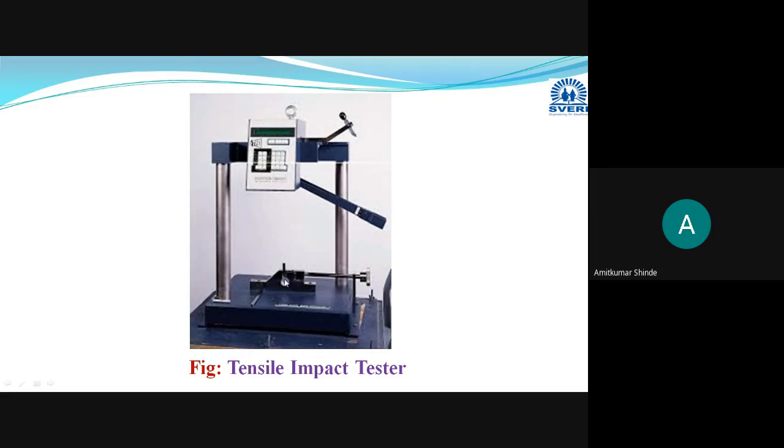Due to this strike impact, and as it is a cantilever beam, some tension is also created along the length, and that component is broken, and you have to collect the readings, the value which you are getting at the end. It will be termed as tensile impact energy.